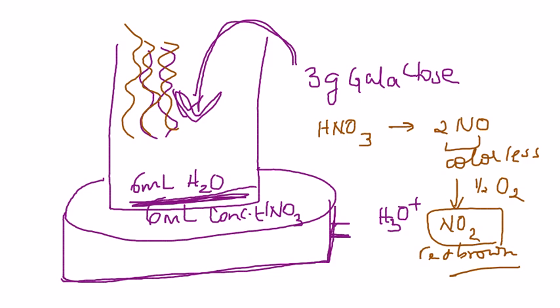Now, the NO2 can react with water, and it can give you HNO3, which is why we are running the entire reaction in the hood, because we don't want to inhale, we don't want to get a whiff of the NO2. And if you do end up getting a whiff of that, you will feel a burning sensation in your trachea and your esophagus, your food pipe and windpipe. And so if you feel a little giddy, not up to the mark, please let us know.